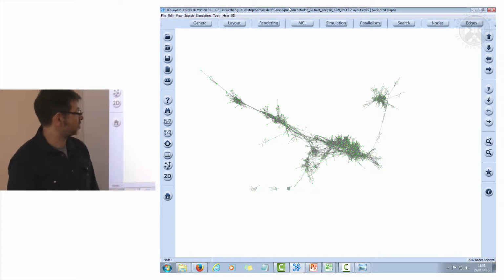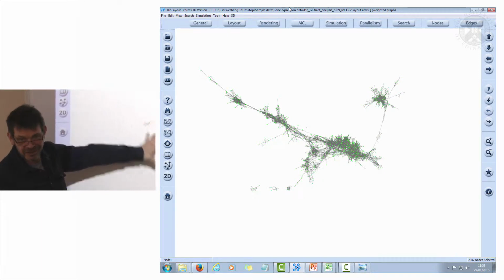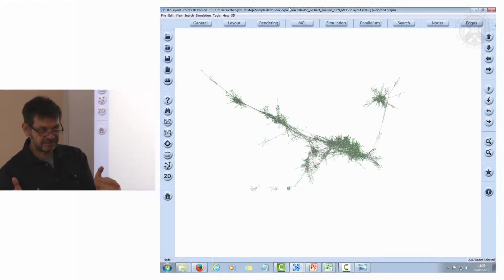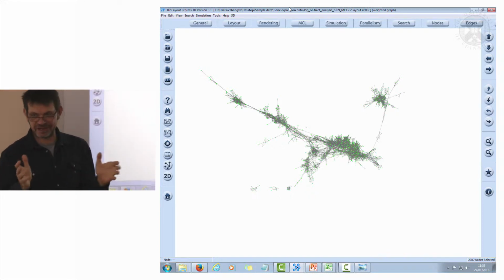So I'm selecting all. I've decided that this is the meaning of life of my experiments, that I've got rid of all the stuff that isn't interesting. And there's a number of different ways you can get rid of uninteresting stuff. You can get rid of low intensity data, so data which never gets above about 100 in any of the experiments. I don't really trust that stuff anyway.